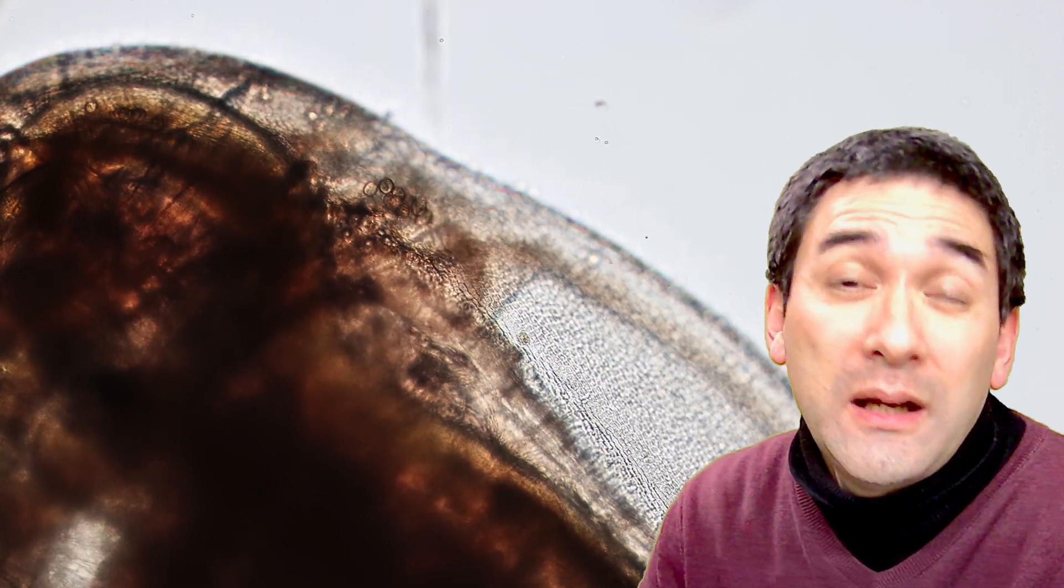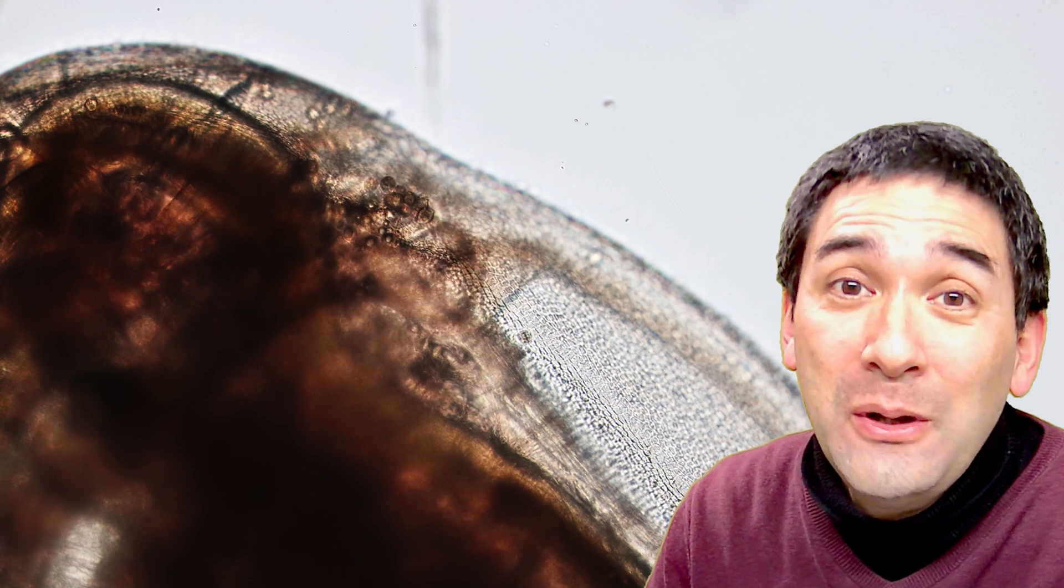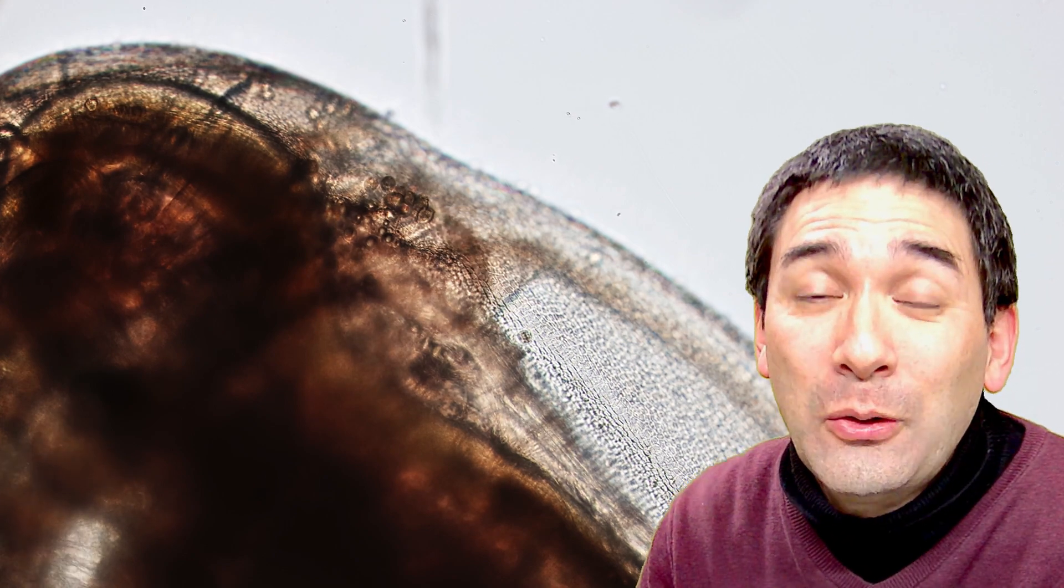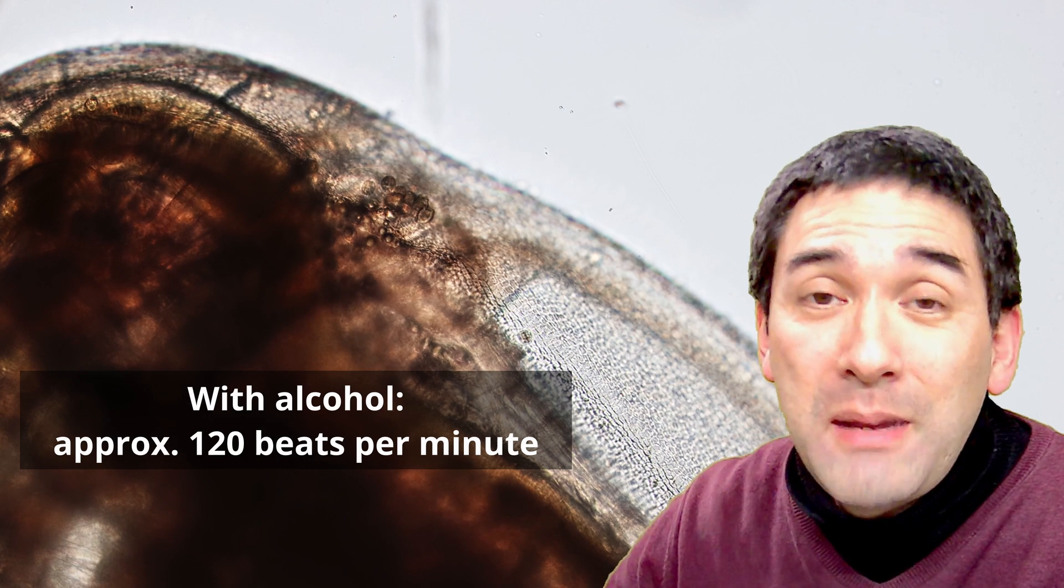However, I had to wait approximately 10 minutes or so. I did not want to wait that long here in the video, so for this reason I basically then wanted to show you what happens after a couple of minutes.